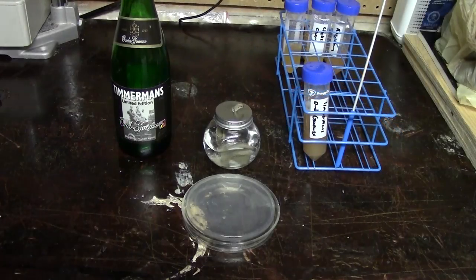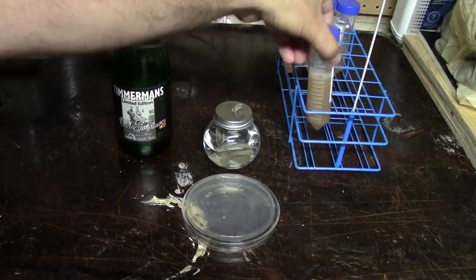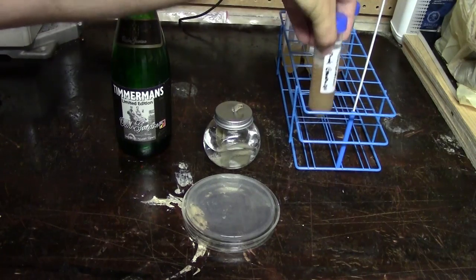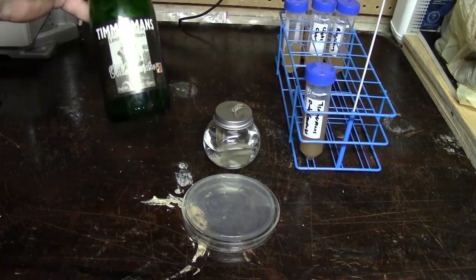So for this process we need a few things. We of course need our source of organisms. In this case I've got a mixed culture of yeast and bacteria that I pulled out of a bottle of Goose.